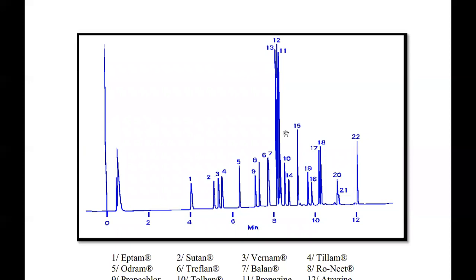So remember what I was saying, that the number of peaks that are detected will depend on the number of components that are in there. So this is how the peak appears, and then you're able to see.